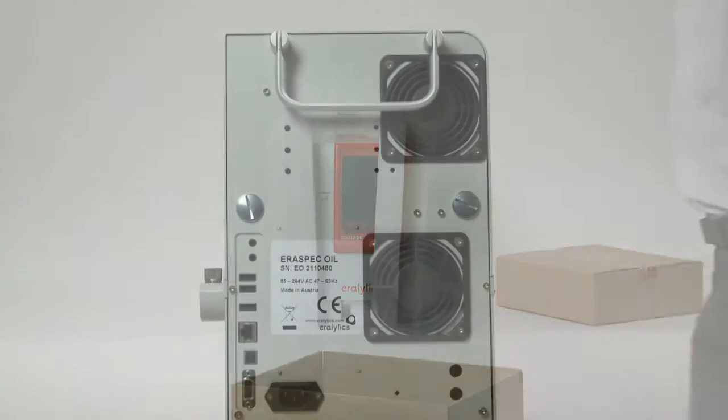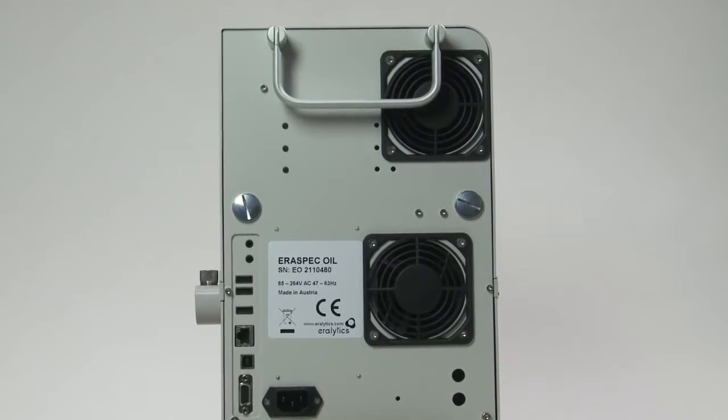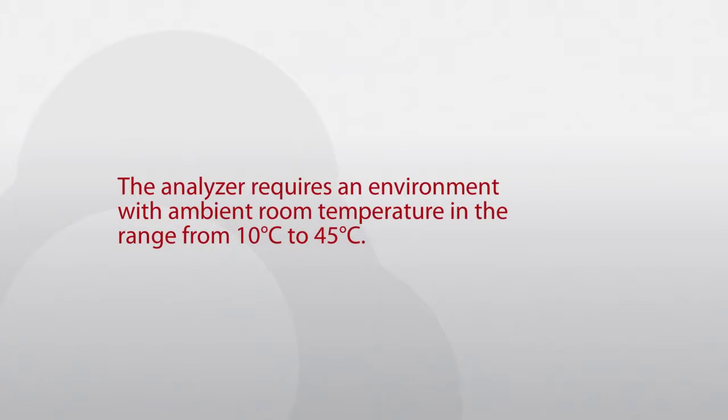Make sure that the vent holes of the analyzer are not obstructed. The analyzer requires an environment with ambient room temperature in the range from 10 to 45 degrees Celsius.